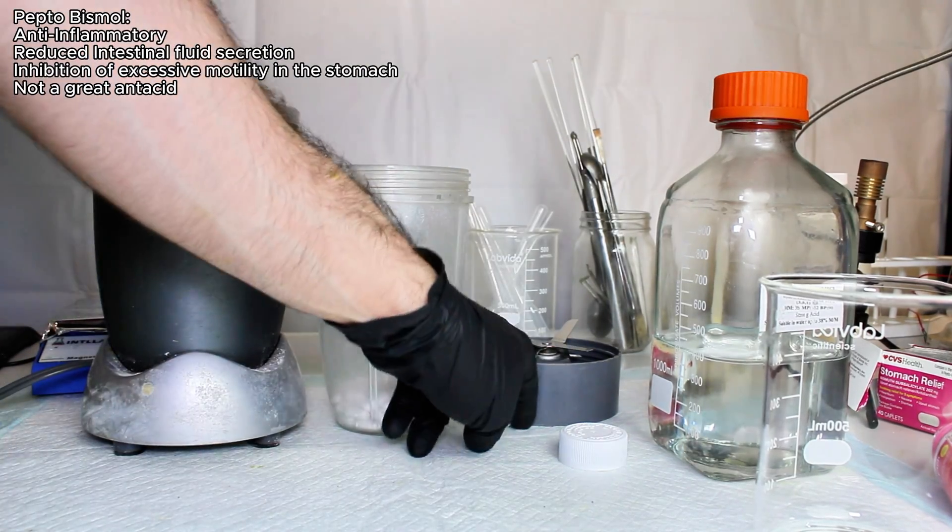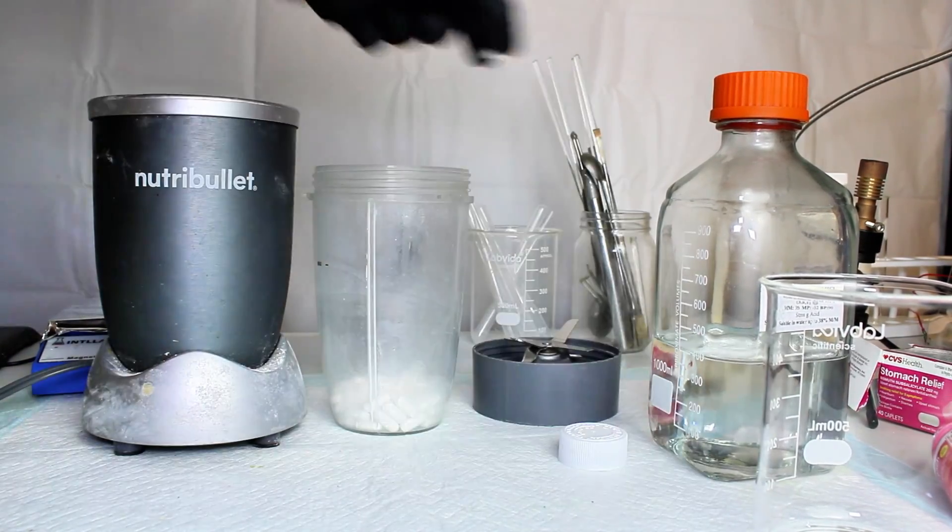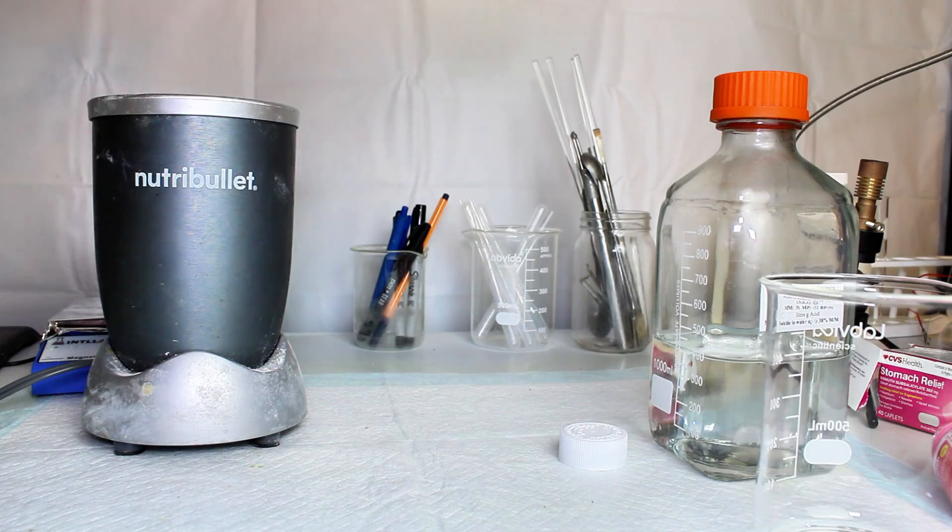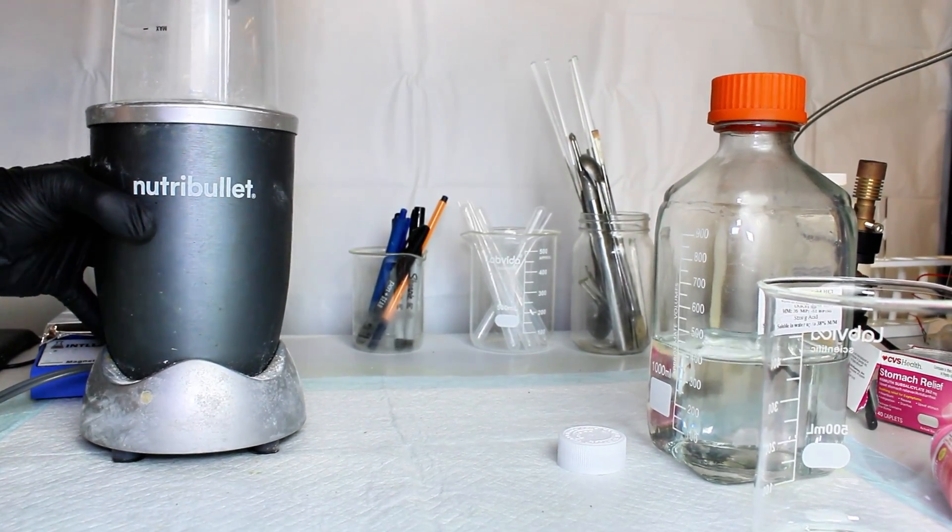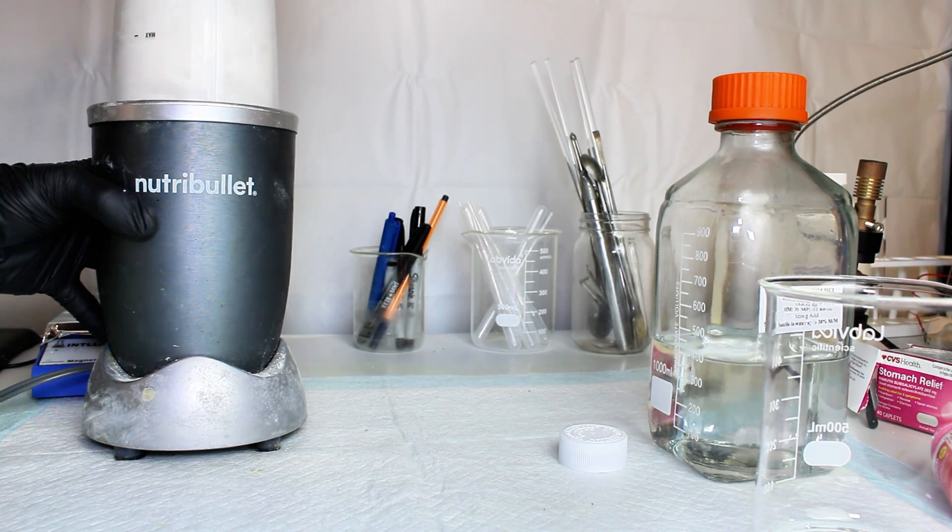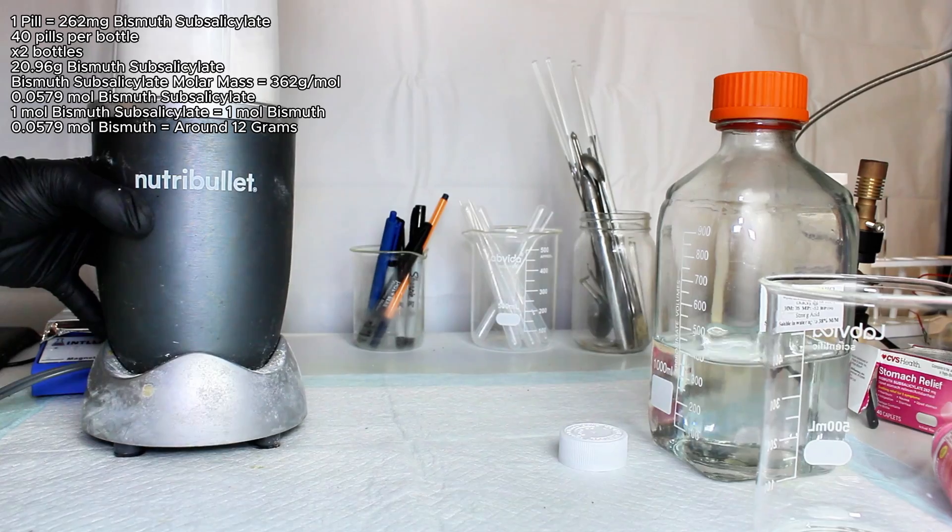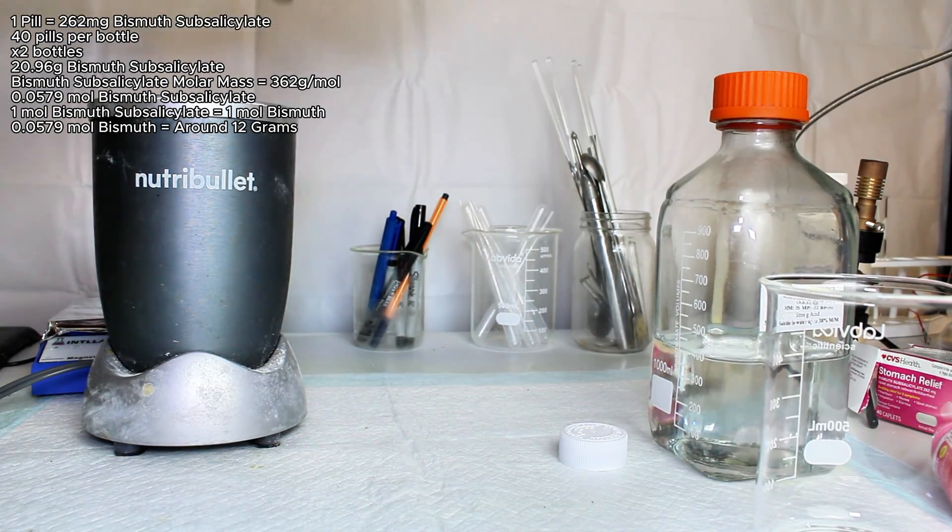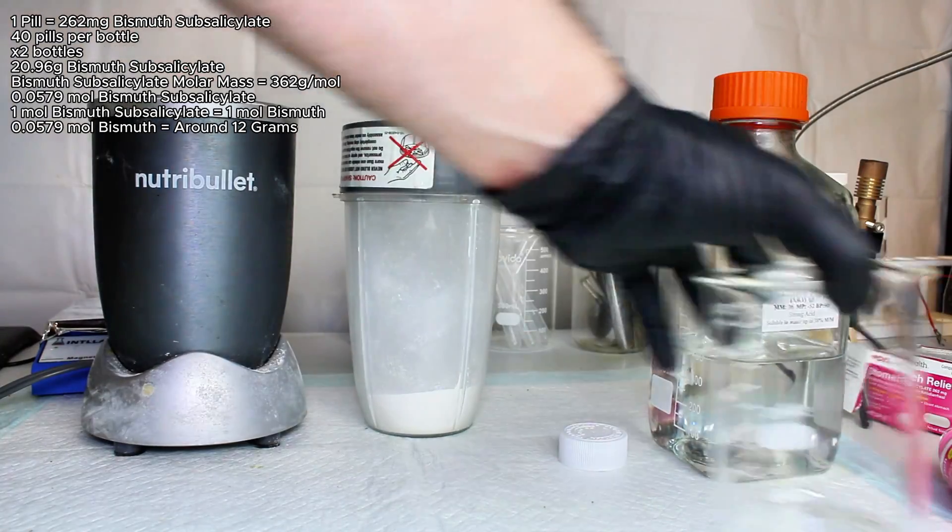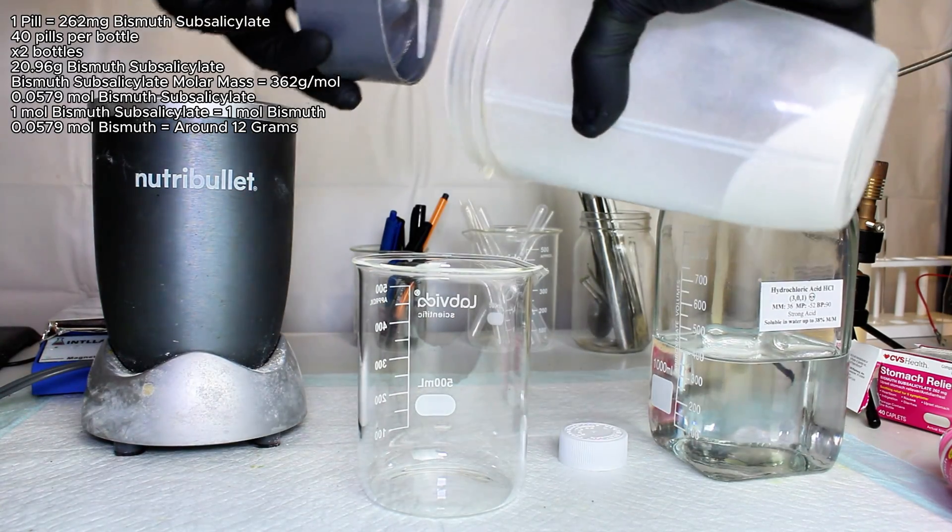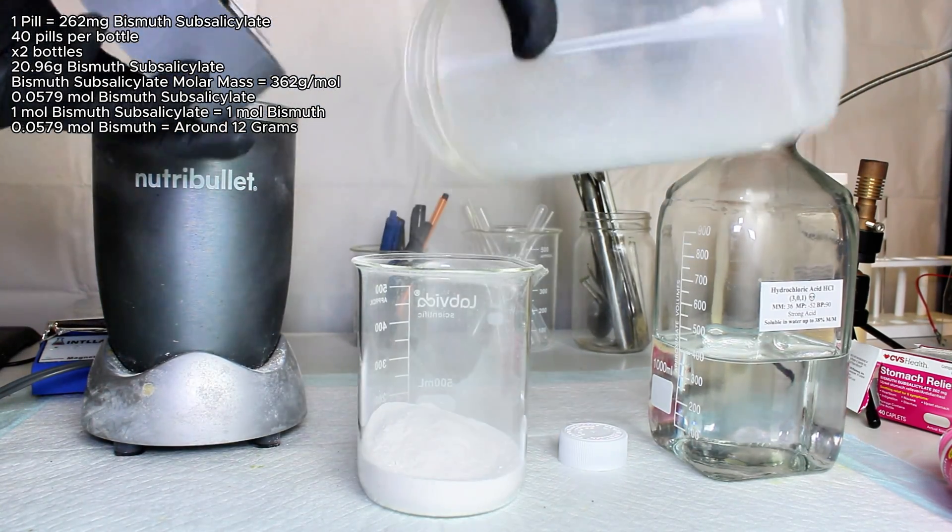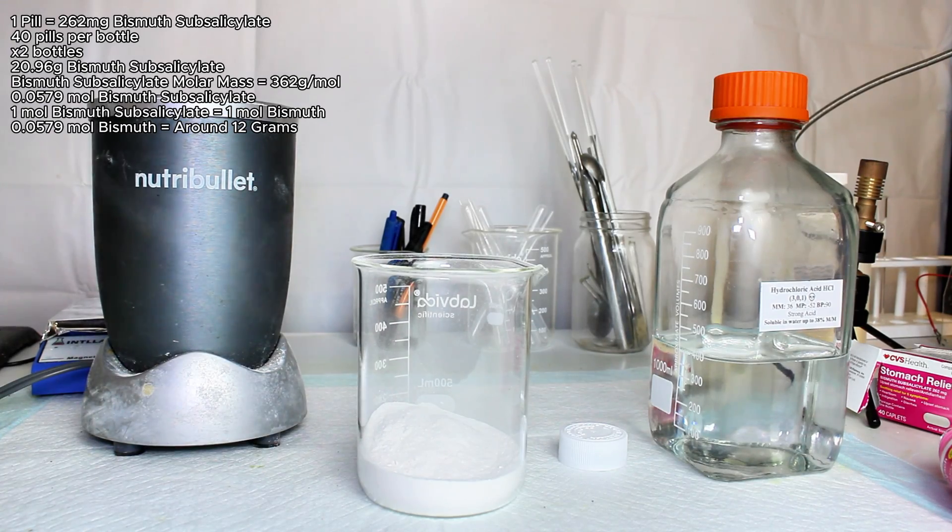What I find interesting is that this medication actually contains a significant amount of bismuth, which can be isolated fairly easily, particularly from the pill form. Each pill contains 262 mg of bismuth subsalicylate, which corresponds to 151.3 mg of elemental bismuth. Since there are 40 pills in each bottle, I should technically be able to extract around 12 grams from the two bottles I have here.